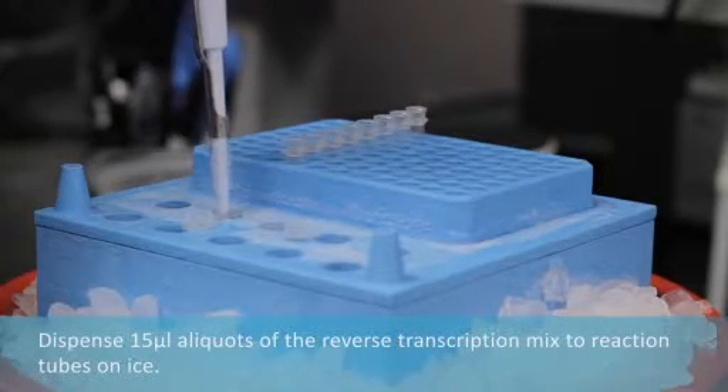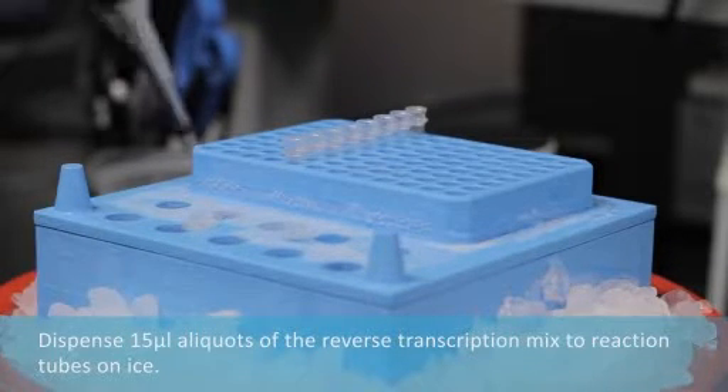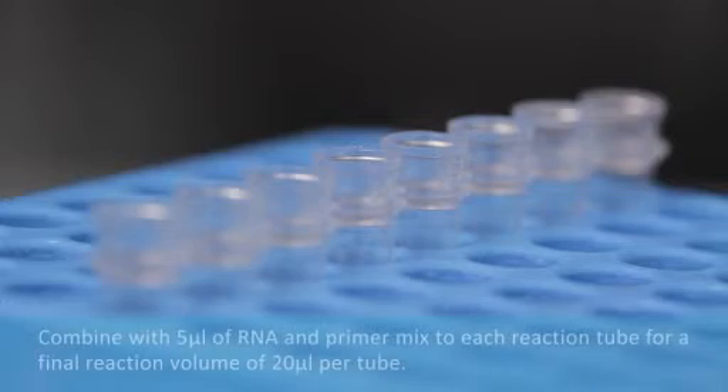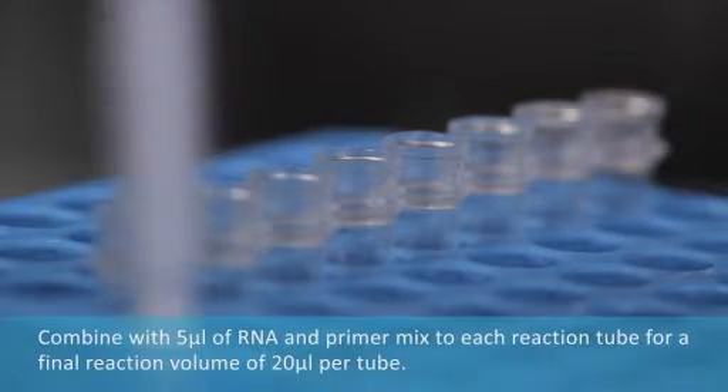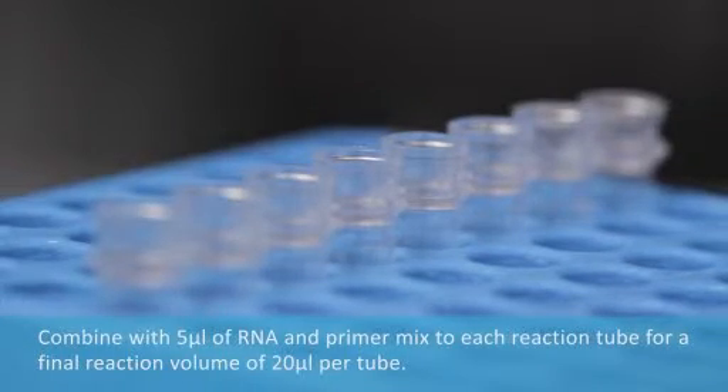Dispense 15 microliter aliquots of the reverse transcription mix to each reaction tube on ice. Add 5 microliters of RNA and primer mix to each tube of reverse transcription mix for a final volume of 20 microliters per tube.